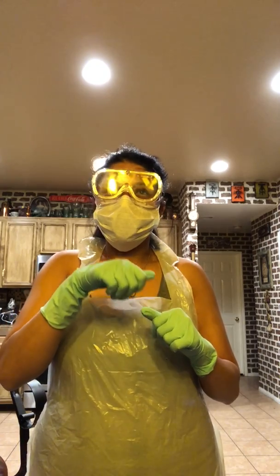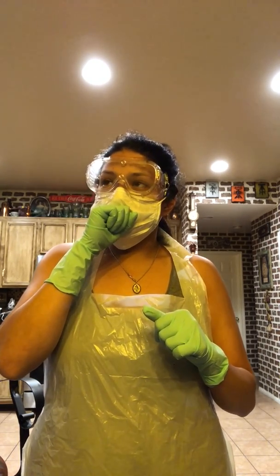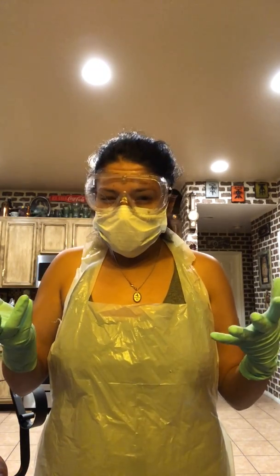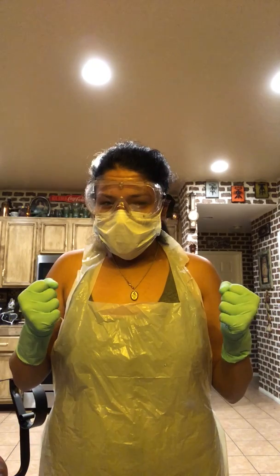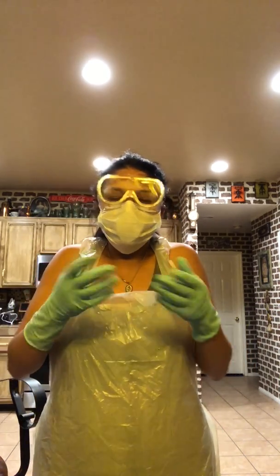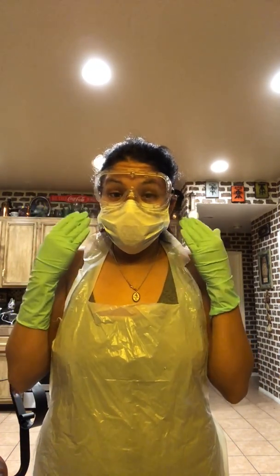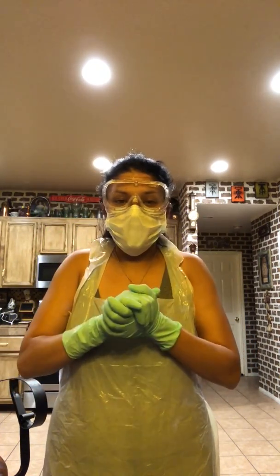After the yeast was made, I think I grabbed 0.25 milliliters, something around that. I can't really remember off the top of my head. Again, I'm going off of memory. I'm not looking at anything. I turned off my computer screen so I wouldn't look at anything.